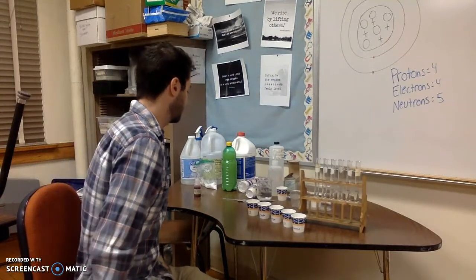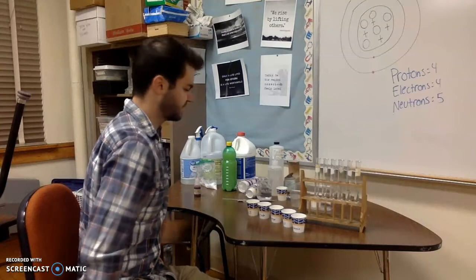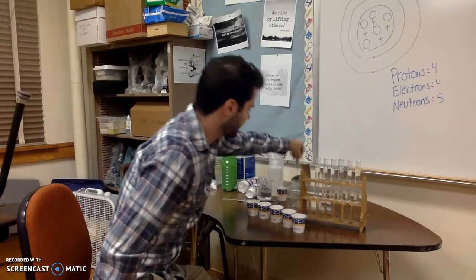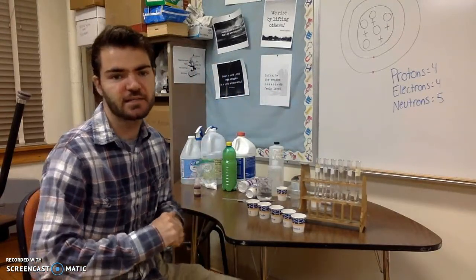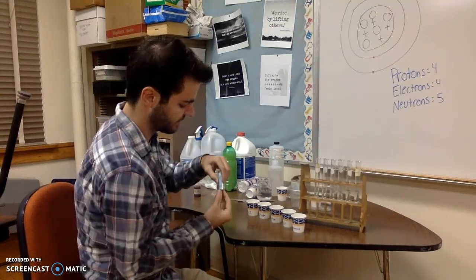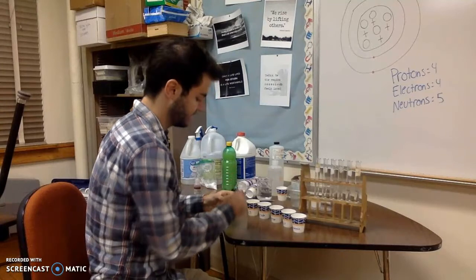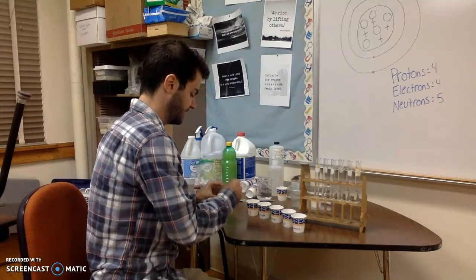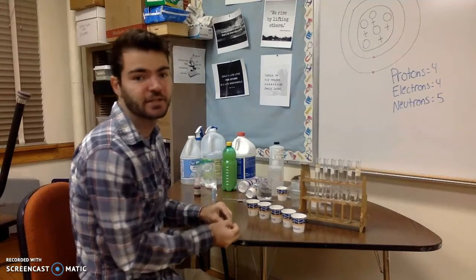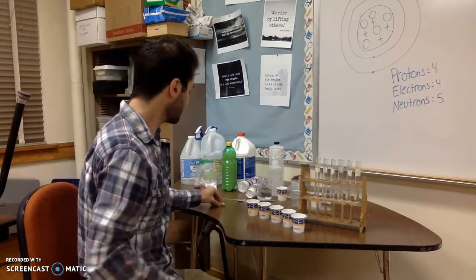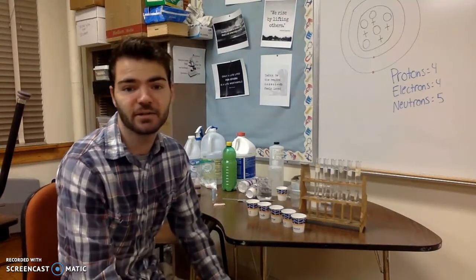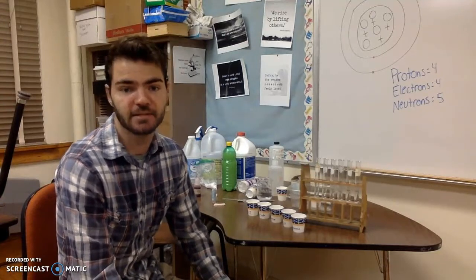We're going to use a red litmus paper test. So I'm going to get some red litmus paper. We won't typically use these to test for acids, but today we will. Red litmus paper, obviously, is red. And if it is dipped into an acid, the color is not going to change. It's going to stay red. So we'll know when we dip these in, if there is not a color change, it's an acid.